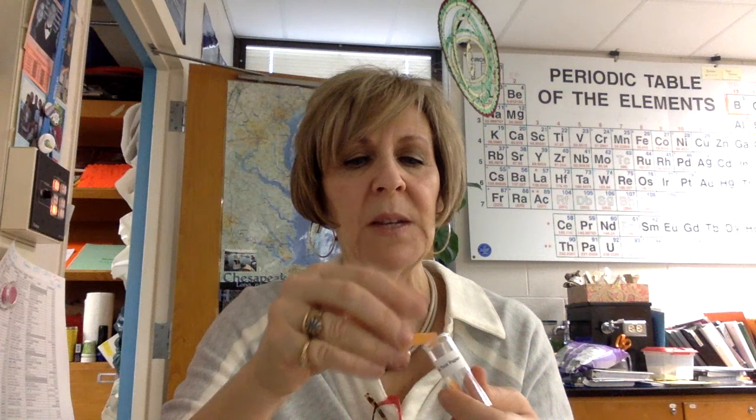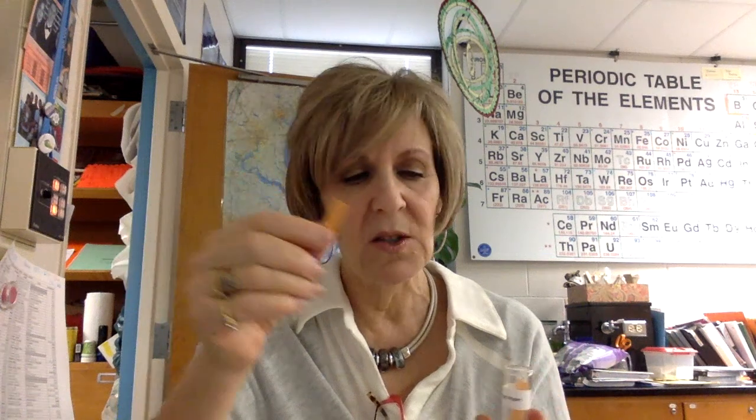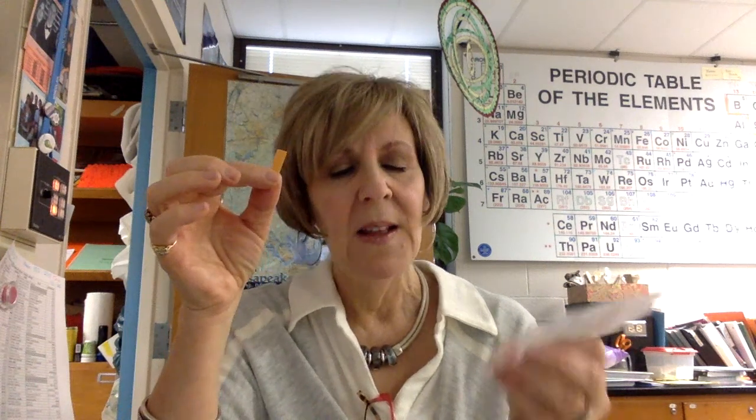So you're just going to take one of these little tiny test strips. There are a couple of them together. I only have one per class, per group. So please don't lose these, or don't use more than one. So what you're going to do is, this is Santiago's blood. Now, it's not really his blood, it's simulated blood, but you're going to dip it in, and then you're going to test his blood, and then you're going to compare the color change to this chart up here to see what his blood levels of lead are.